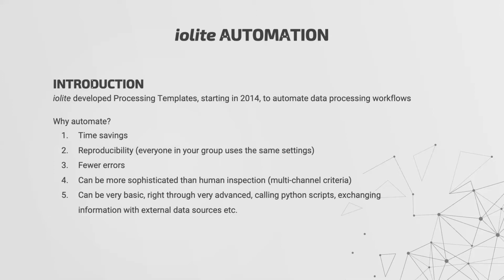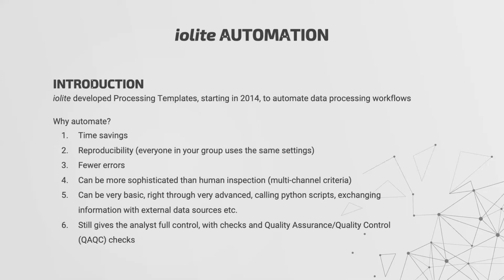Like I said, you can keep them very basic if that's what you feel comfortable with, or you can make them super advanced if you know what you're doing and you're happy to check the results of that. And they can do all sorts of things. And possibly the most powerful thing that we have is the ability to call Python scripts, which then opens up a huge amount of potential for getting data from other places and sending data to other places.